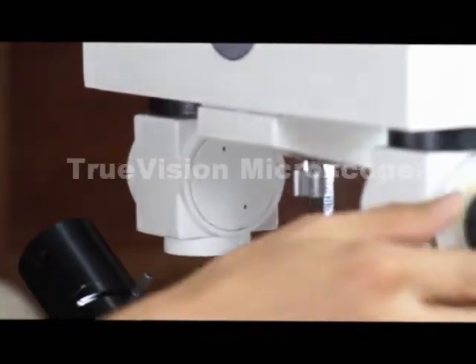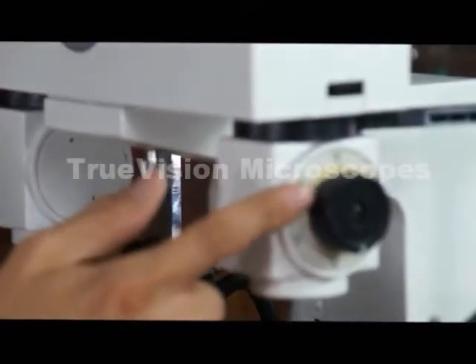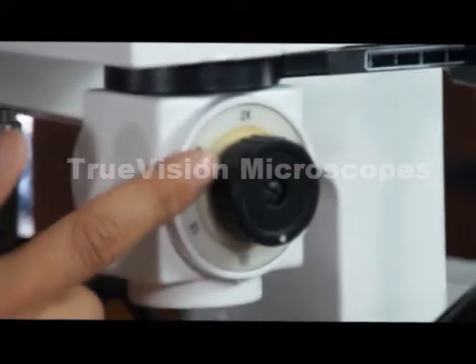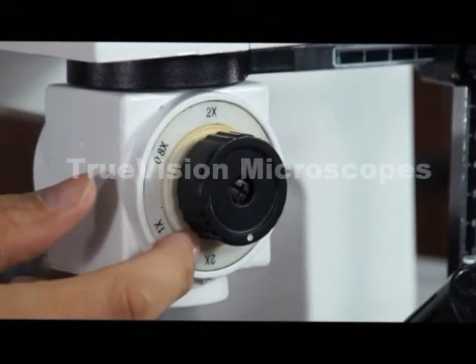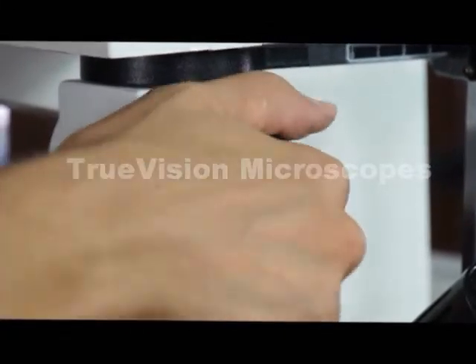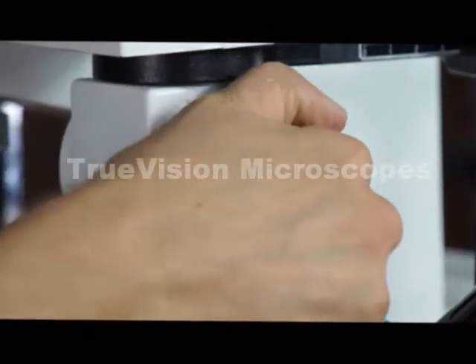The particular objectives are 0.8x, 1x, 2x, 3x, and 4.8x. All of that is adjusted with this knob.